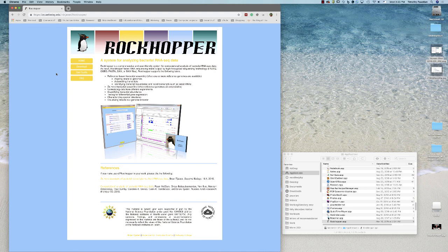It's a program that compiles all the stuff, as we talked about in the lecture, maps all the sequences to their sites on the DNA, and then predicts what gene that is. So you'll come to this site here called RockHopper.